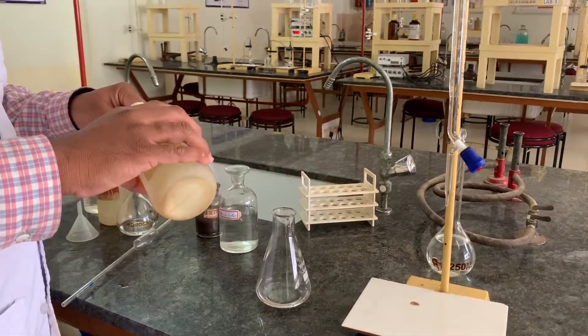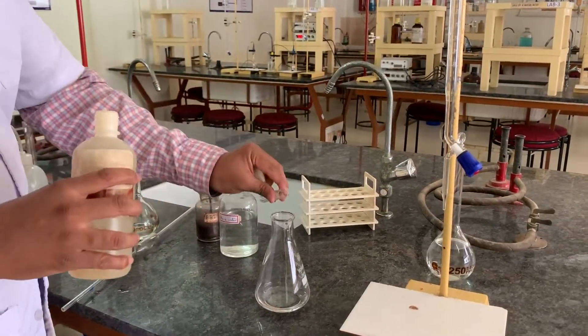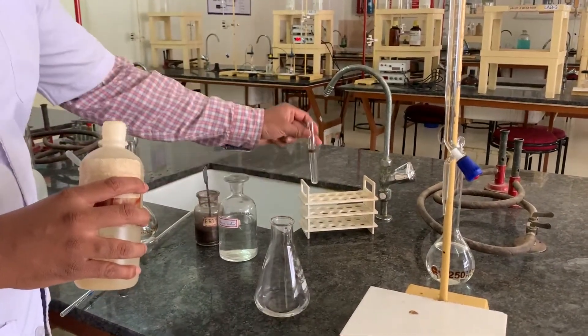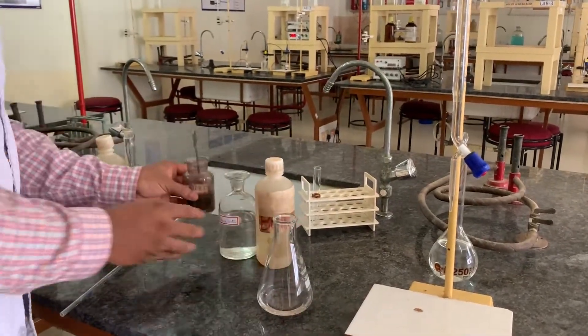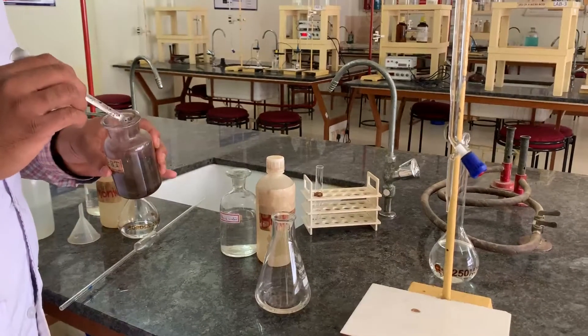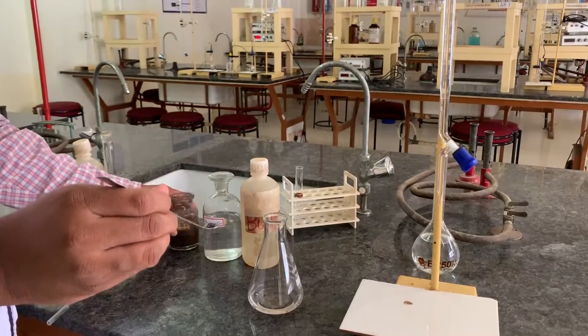That buffer we are going to add, half a test tube, to maintain the pH at 10. After addition of buffer, a pinch of eriochrome black T indicator is added. A pinch of indicator is added.